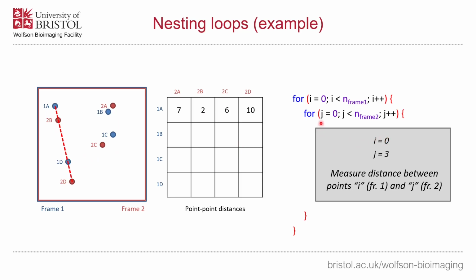equal to 0. So now, in that first loop, we've iterated over this 4 times, and this now is no longer less than, so j will be 4, so it's no longer less than the number of objects, it's equal to the number of objects, so we increment our i. If you look at that, i is now equal to 1, but j, because we're starting this again within this loop, j is equal to 0, so now we move on to our second object in frame 1, but we go back to comparing our j equals 0, so our first object in frame 2.